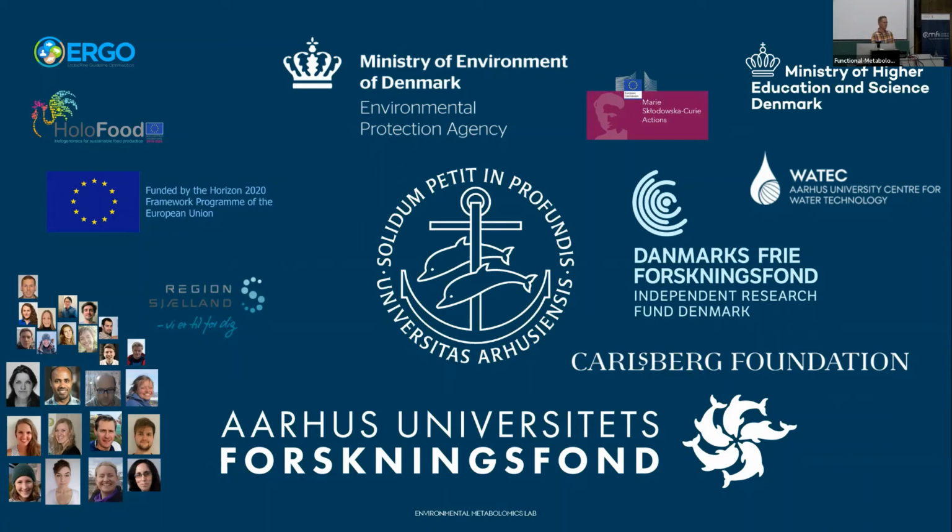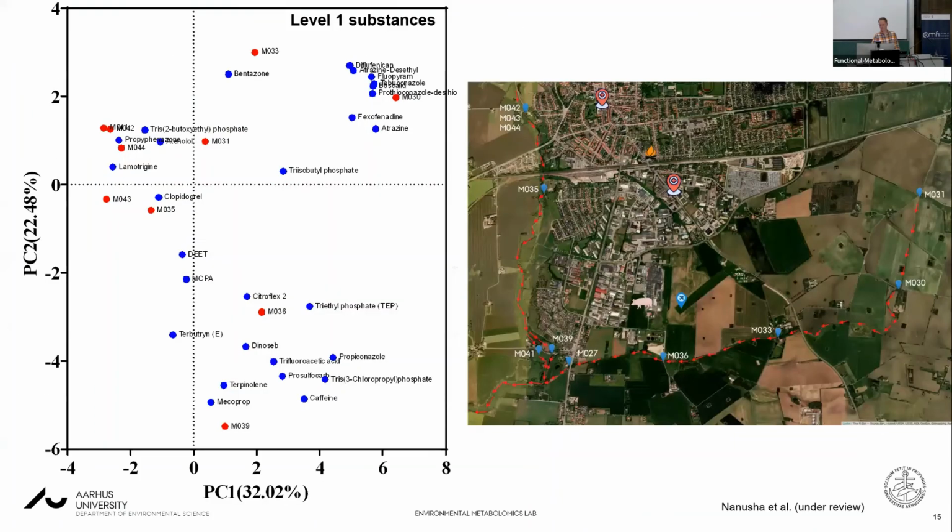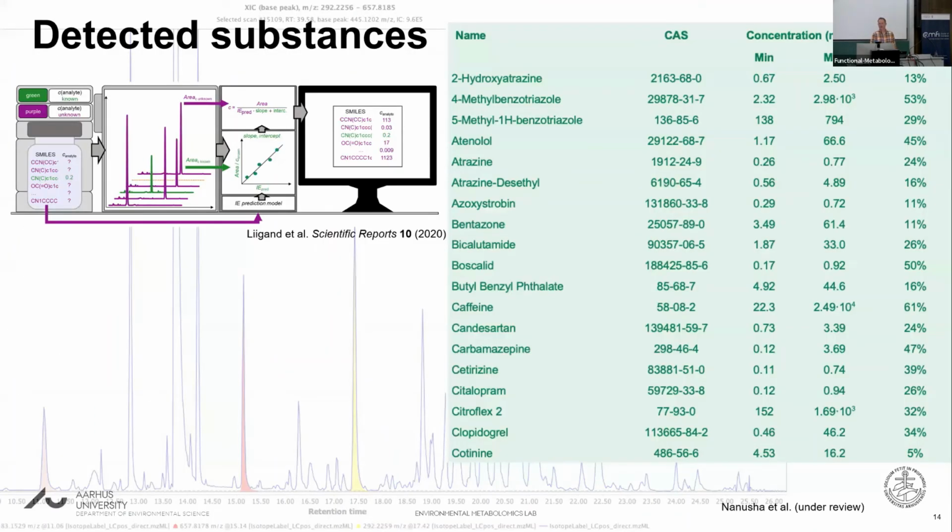I mean, the problem will be that you can only do external calibration, or you have to rerun all the samples, right? Yeah. So then, think about ion suppression. There might be other factors that feed in. There was one slide where you showed the concentration range. That was the uncertainty interval, or the minimum and max that you observed. That was the minimum and max between the 38 samples, I think. So there are some pretty high ranges there.